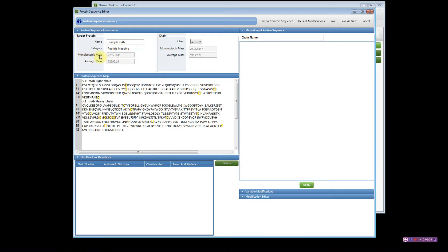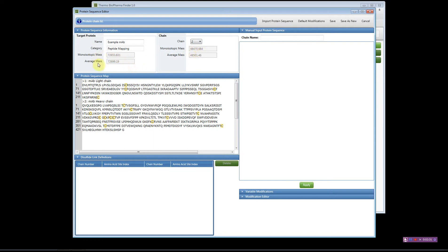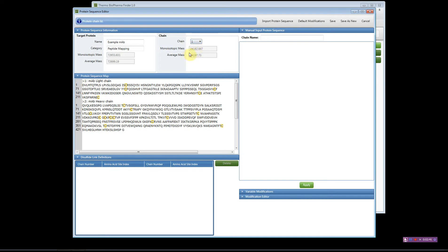The software will automatically calculate the monoisotopic mass and the average mass for all proteins in the FASTA file. When you look at the light chain's molecular weight, chain number one will show the light chain; select chain two to see the molecular weight of the heavy chain. The total shown is for all proteins in the FASTA file, and individual masses for each chain are displayed separately.